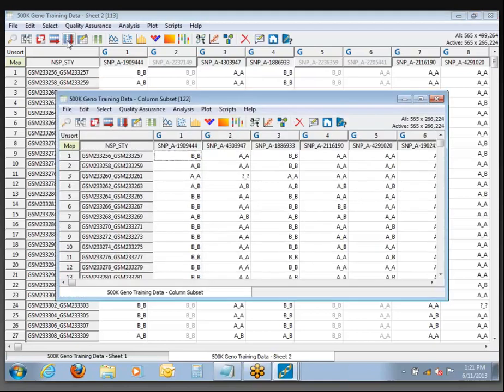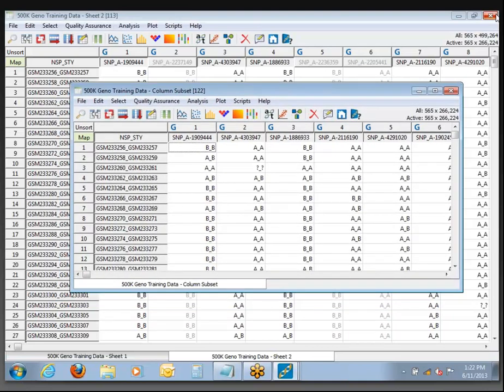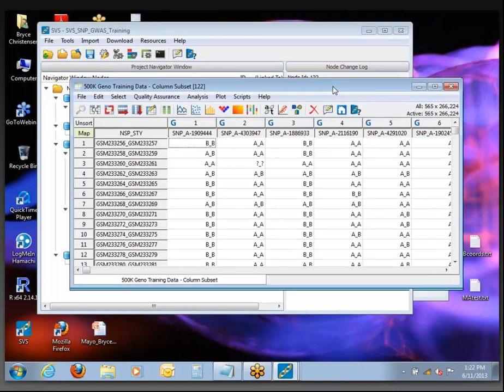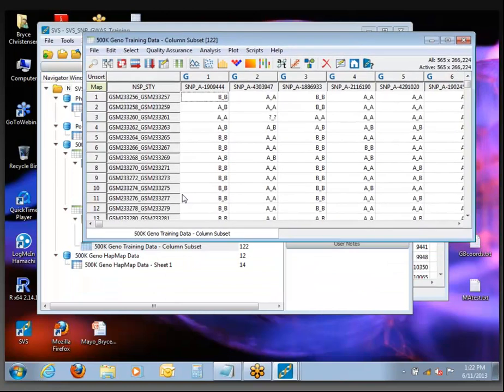This will go really fast. Part of why it goes so fast — if you're interested in the technical aspects — is it's not actually writing a new spreadsheet onto the disk. It's using a relational database architecture in the background where it just knows it's creating a new view of the data set consisting of a limited number of records. So we now have that and we're ready to move on to the next step.